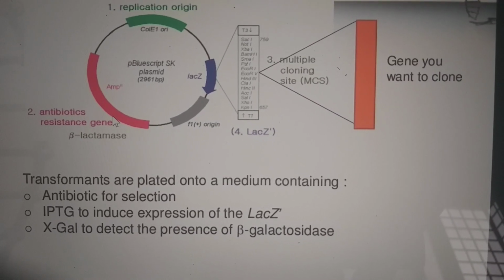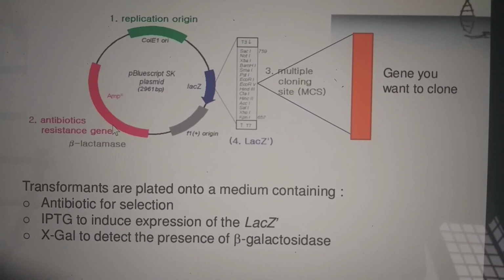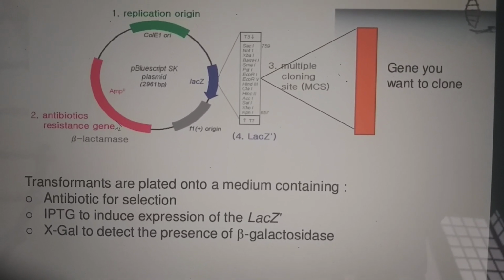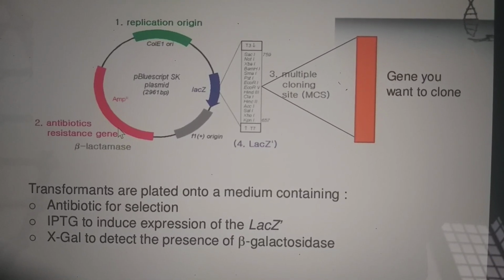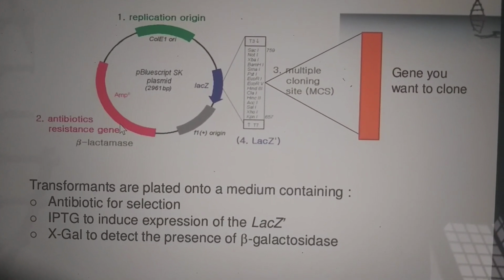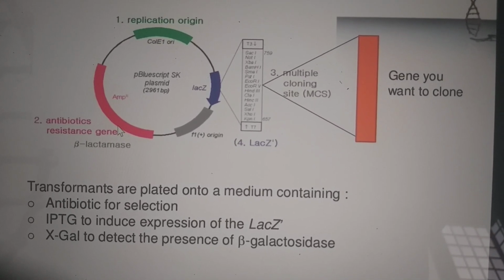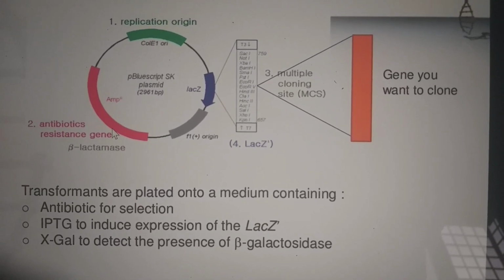In addition to this, you add IPTG in that medium. Now what is the function of IPTG? This IPTG will help to induce the expression of the lacZ gene. And another thing is you add X-gal in that medium. Now what is the role of X-gal?